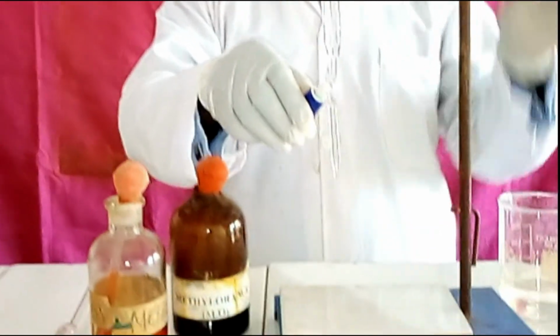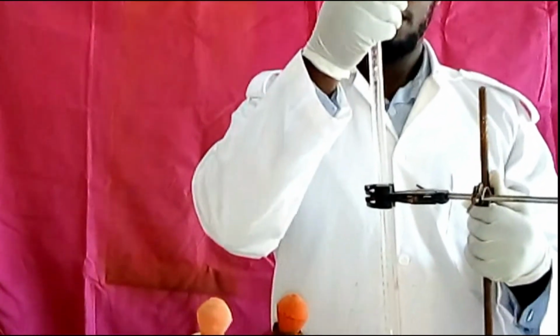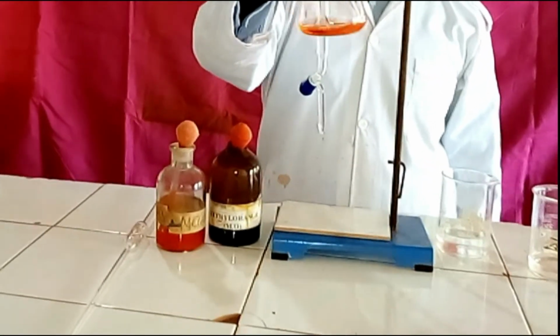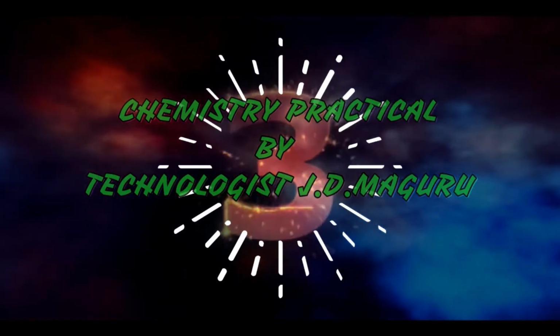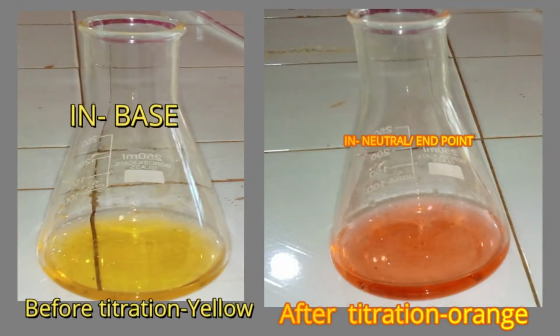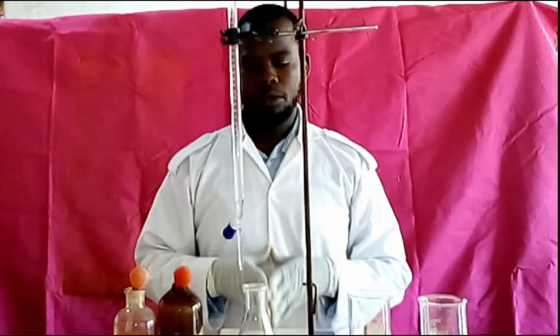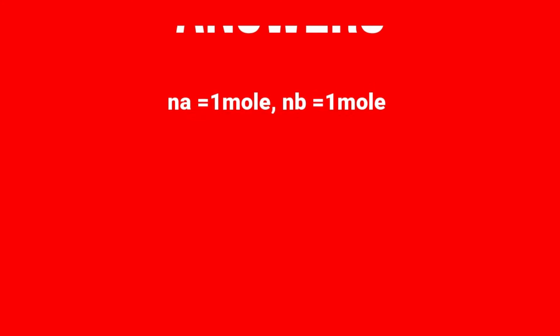Before titration, you are supposed to note the initial volume. Yes, that is 3.8. Then you start titration. That is the ending point for the reaction, and this color is orange. Our volume is 10. After performing the titration, that is the ending point for the reaction. Let's go to the class to see how this question has been solved. And we have noted the volume.